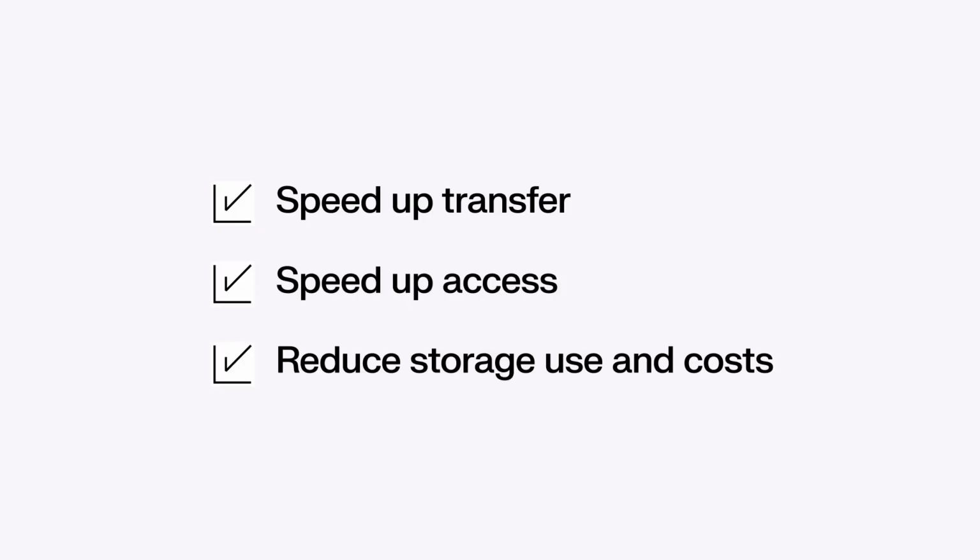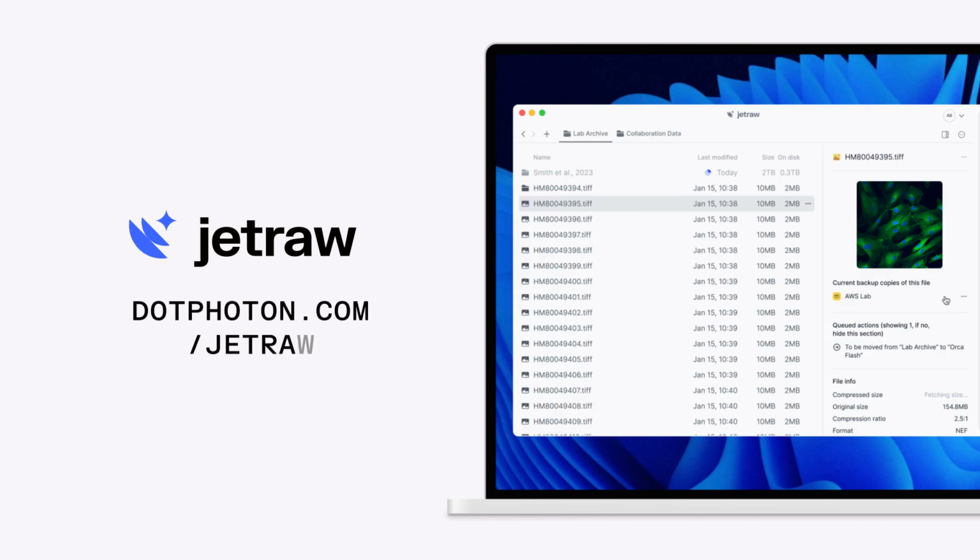Ultimately, Jetraw speeds up data transfer and access and cuts storage costs, helping microscopy facilities and research labs work faster and more efficiently.